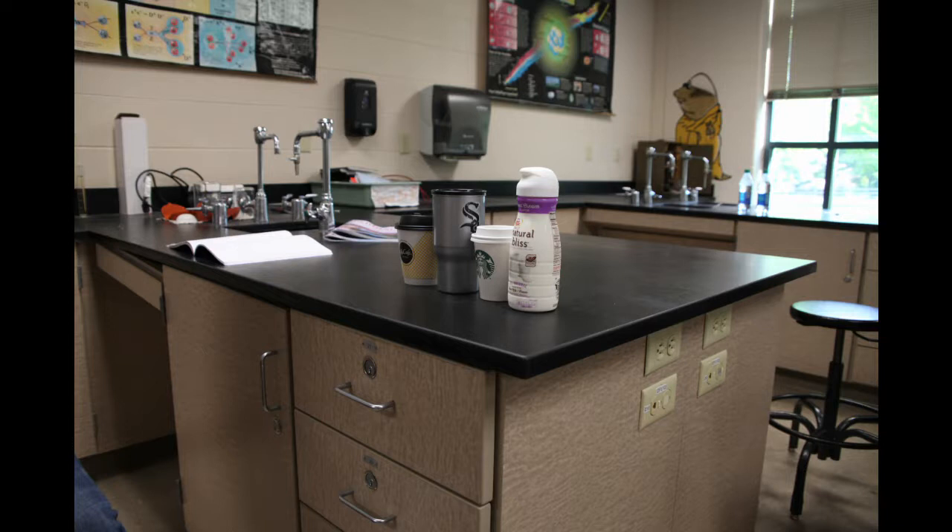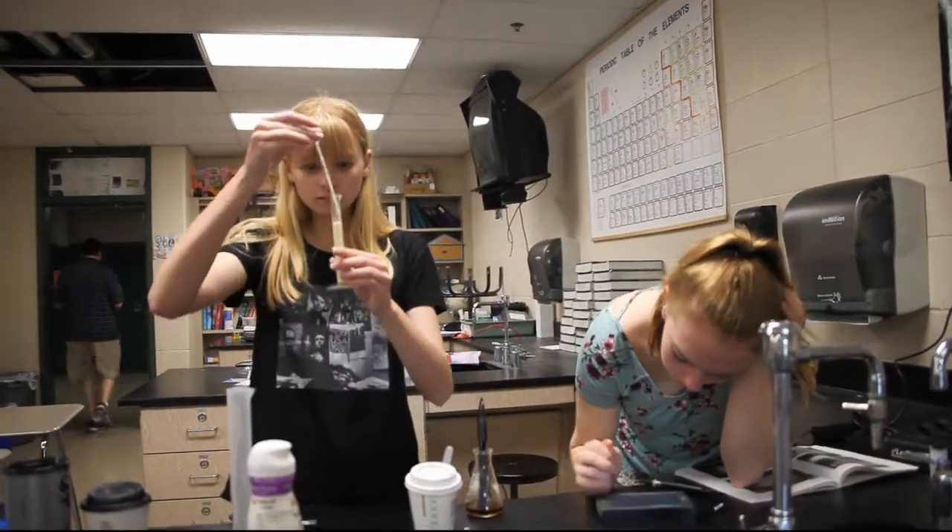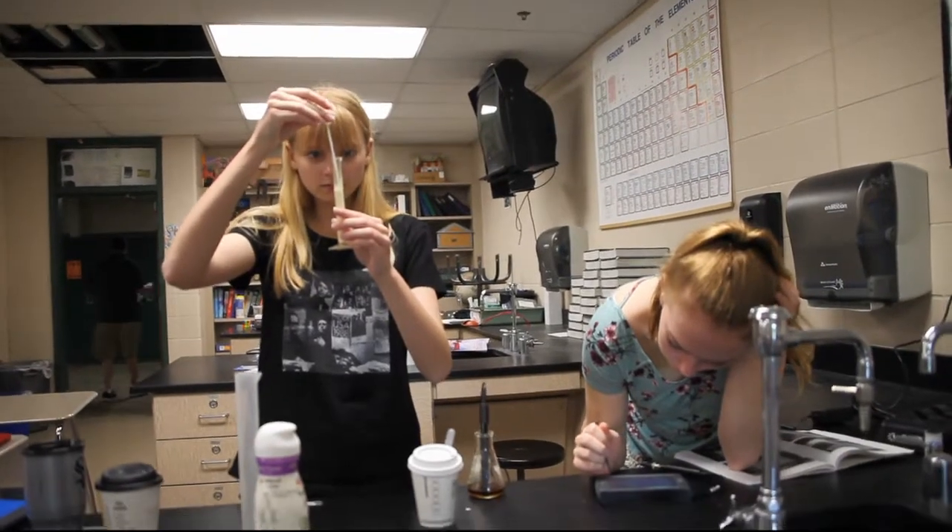For our project, we decided to use titration methods, but utilizing different brands of coffee and Coffee Mate Sweet Cream Creamer. The three brands we used were Starbucks, McDonald's, and home-brewed Gabby Folgers, made with love. We wanted to see how acidic your coffee can be and how the acidity would be affected by the addition of creamer.